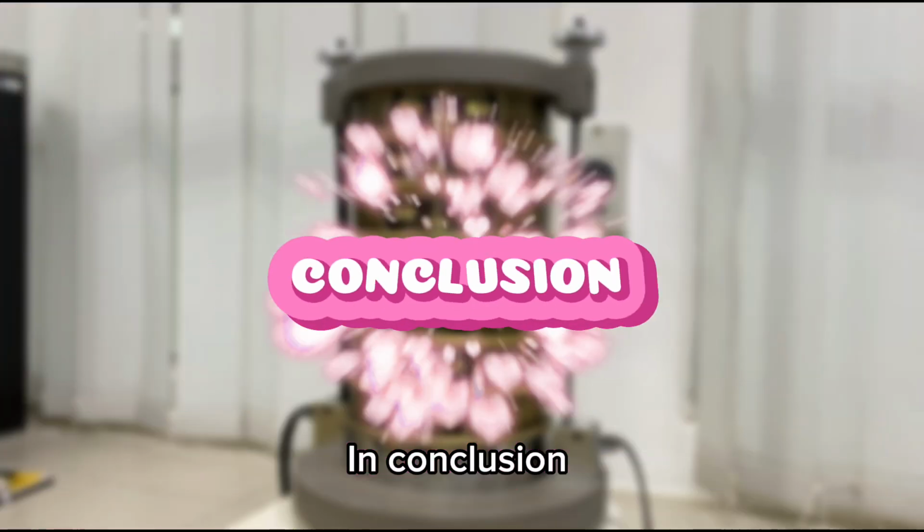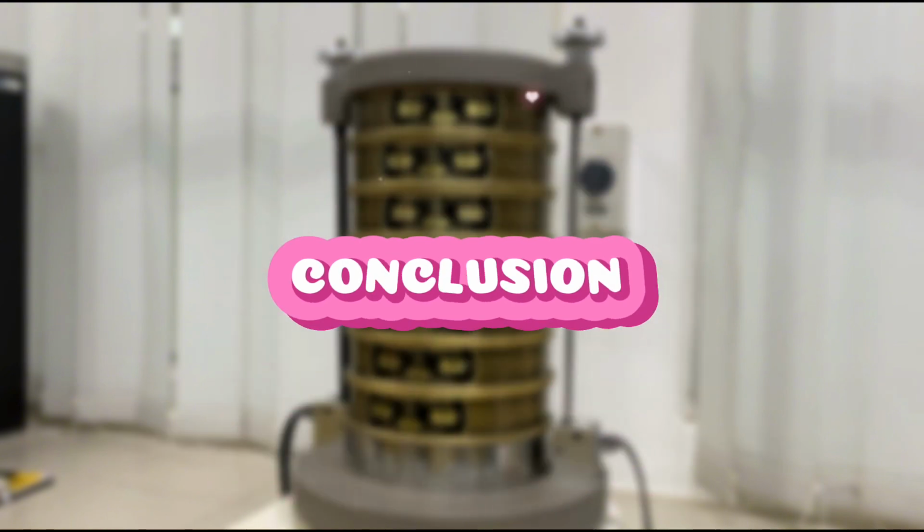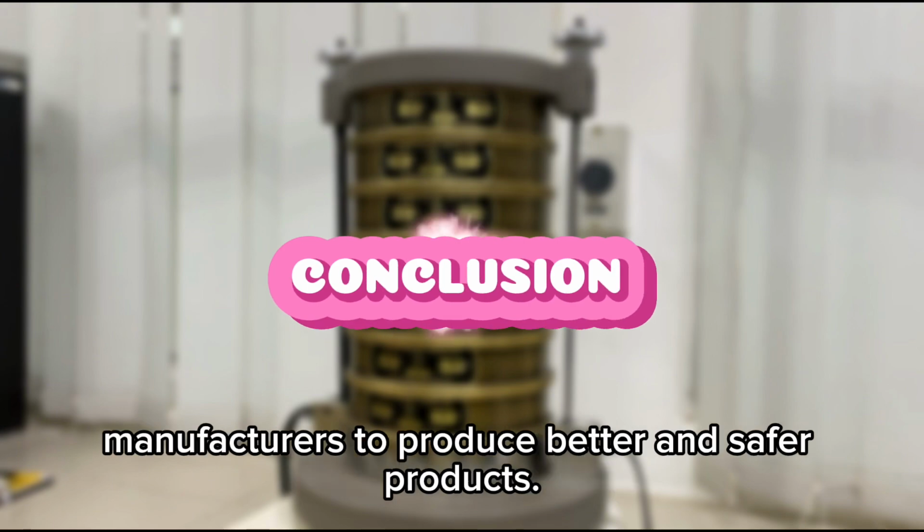In conclusion, the test sieve stack machine is one of the important tools in the food industry. It is to ensure a consistent particle size distribution and help manufacturers produce better and safer products.